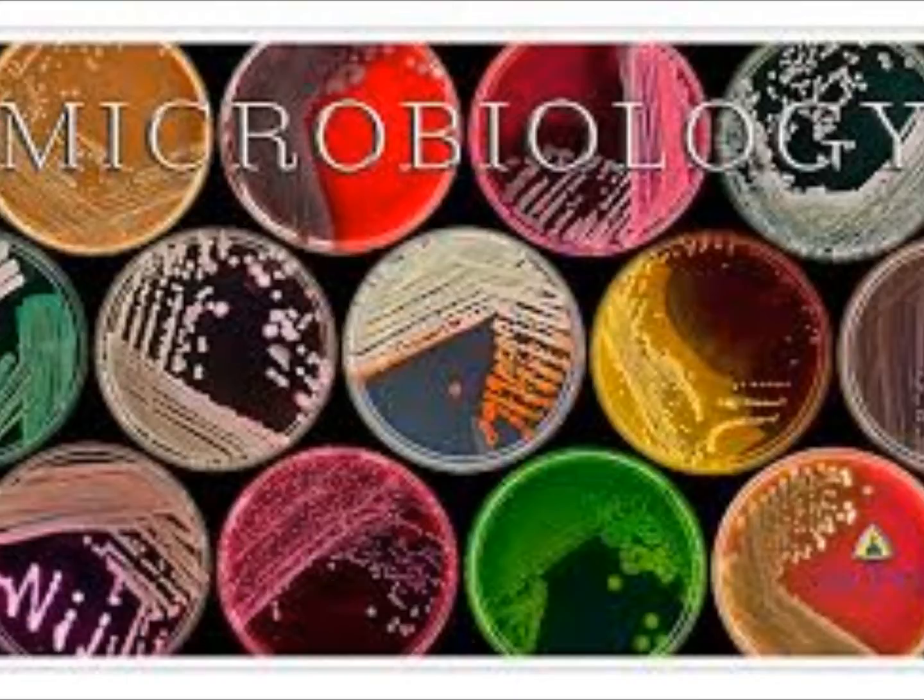We won't move on to anything till everybody has looked at them. Do you wanna start just passing them in now? We'll let them finish up this way, and then maybe at least if we can gram stain, that'll be good. Get the gram stain done, and I'll save it for tomorrow. I'm gonna keep these sheets here with color, LF, hemolysis, because I know Barb will be using this table today. So if anybody wanted to take pictures or anything, plus don't forget to look at that biochemical PowerPoint on Blackboard, it shows a lot of what we're doing.